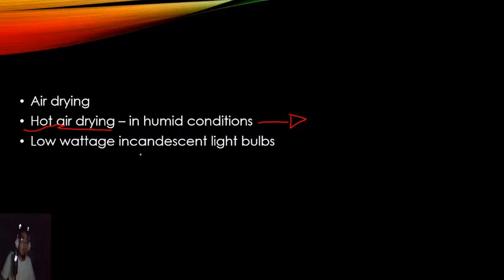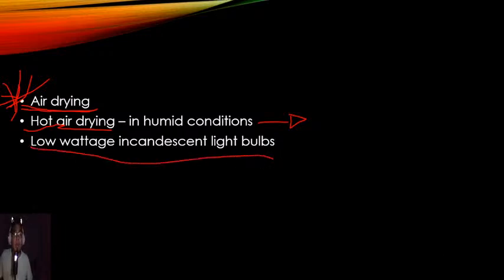Okay, especially if your convection oven is too hot. So I always suggest the usage of air drying. Okay, air drying talaga siya lalo na sa Philippines. Okay? Pang social lang yung slide dryer na low wattage incandescent light bulbs na yan.